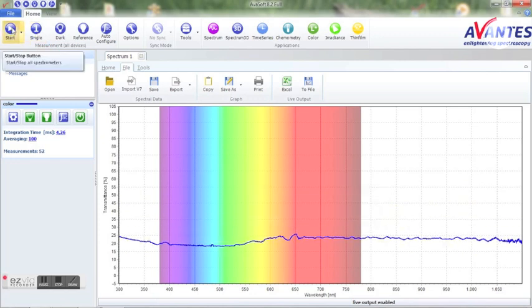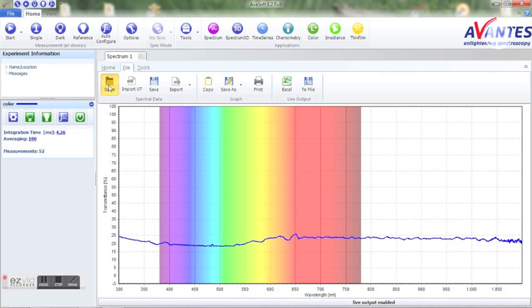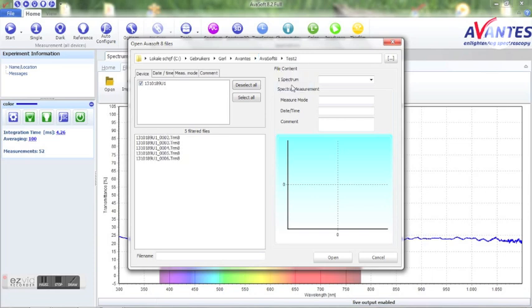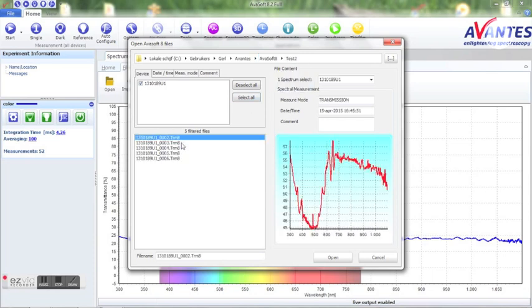After the logging is done, the files can be viewed with the open files option. Select the subfolder, and here you will be able to find your recorded data.